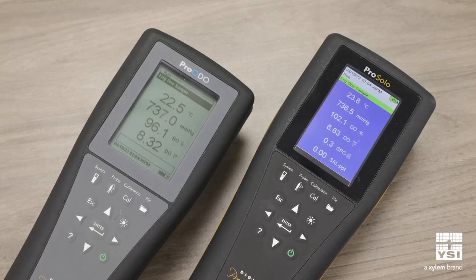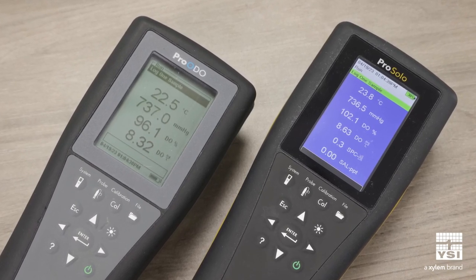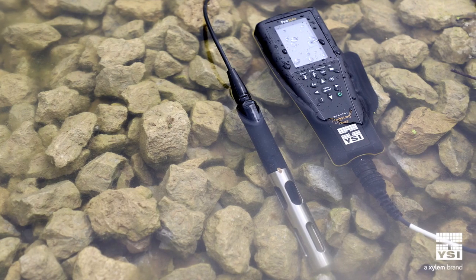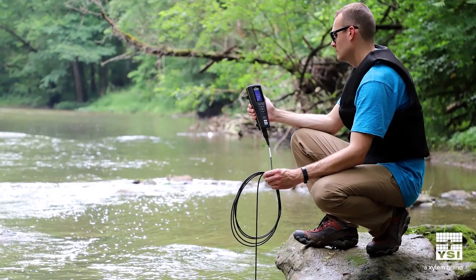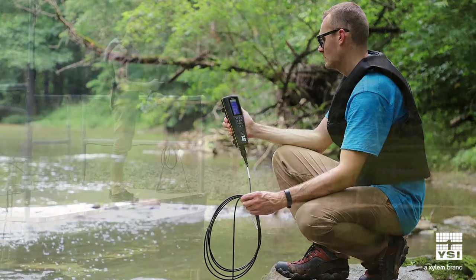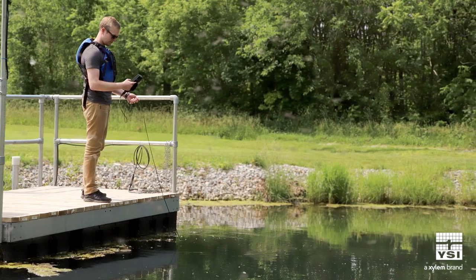As a reminder, the ProOdio has been discontinued. The ProSolo advances our goal of providing reliable and accurate dissolved oxygen instrumentation for water professionals everywhere. The ProSolo shares a few key similarities to the ProOdio: the same rugged, waterproof design with military spec connectors that can withstand harsh field conditions. It uses the same advanced optical dissolved oxygen technology and features an internal barometer for calibration.